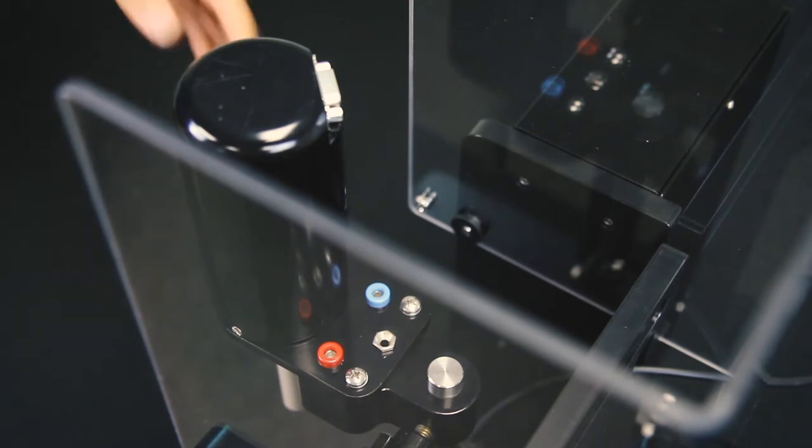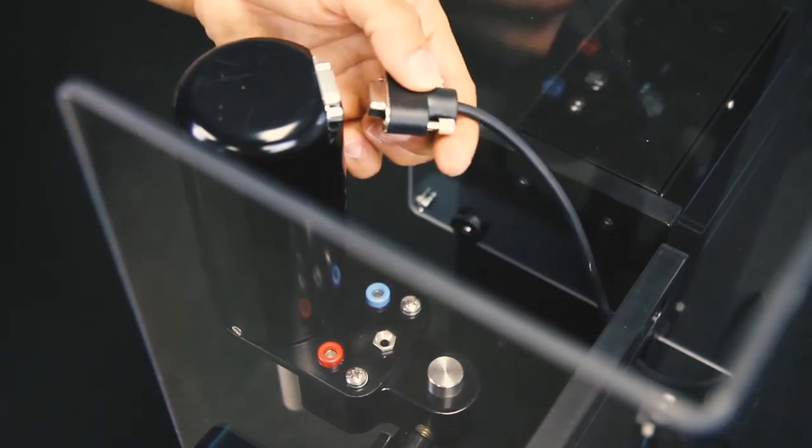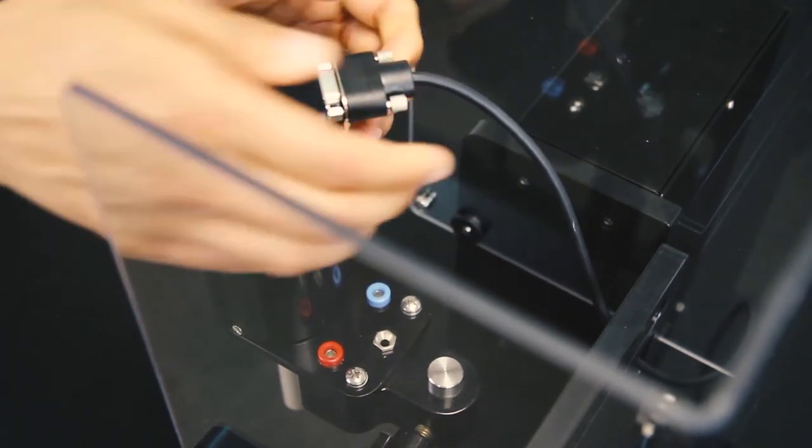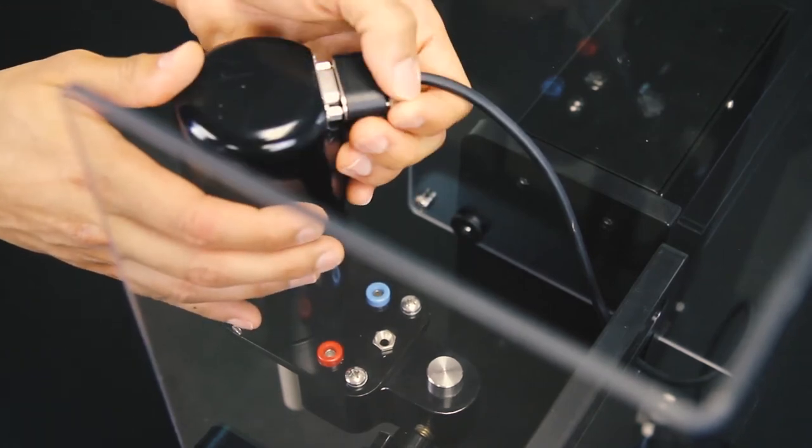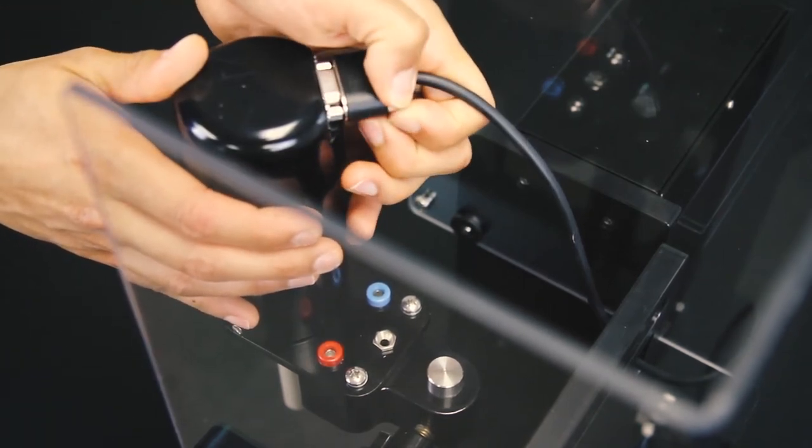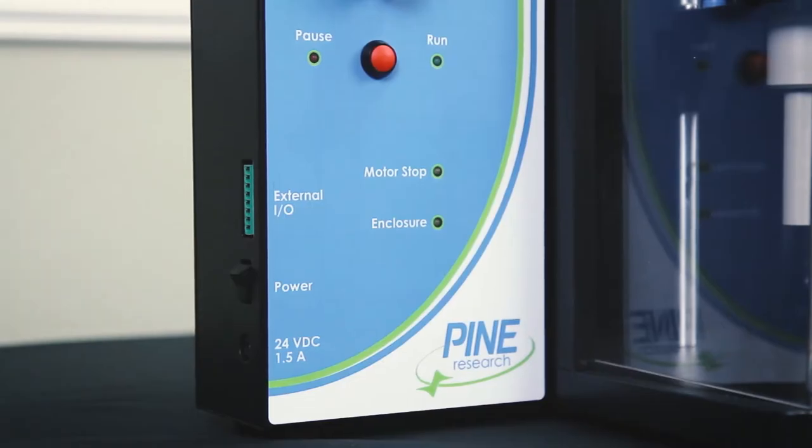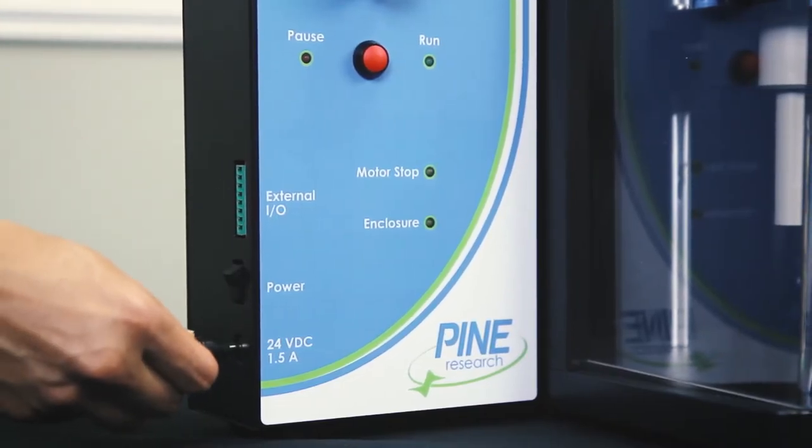Reconnect the motor cable and tighten the two thumb screws with your fingers. Plug the Wave Vortex back in and turn it on.